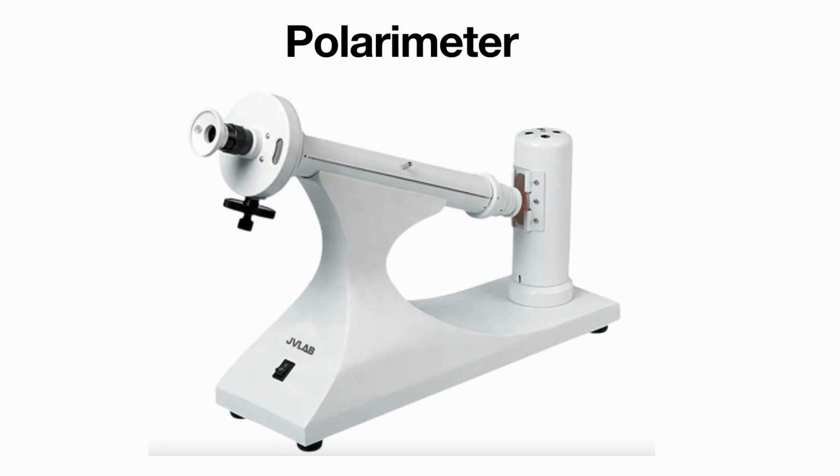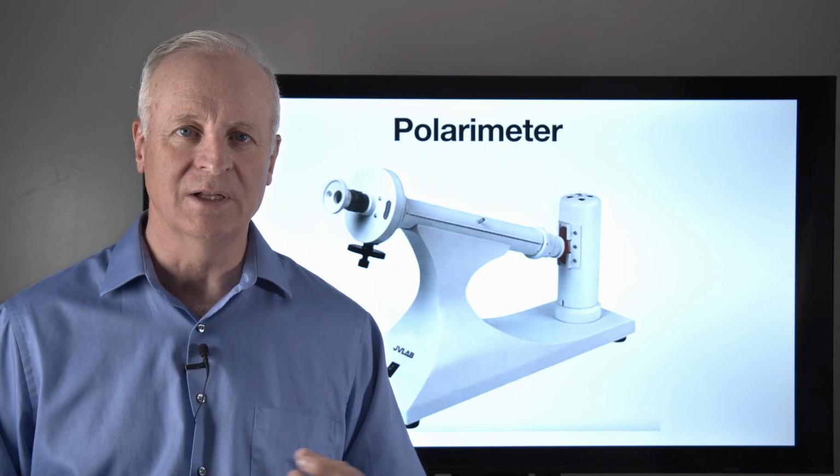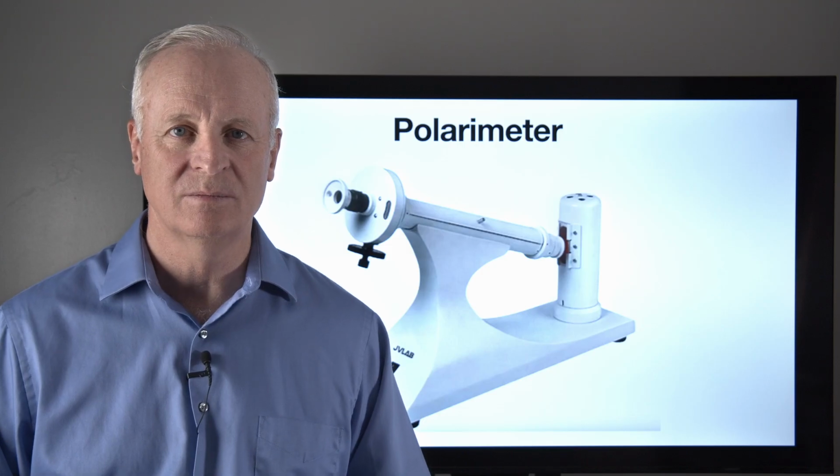This device is the polarimeter. It is used to determine the optical rotation of an essential oil, whether it's left-hand or right-hand dominant. The polarimeter is a very important analytical laboratory tool found in research and quality labs in essential oil companies.